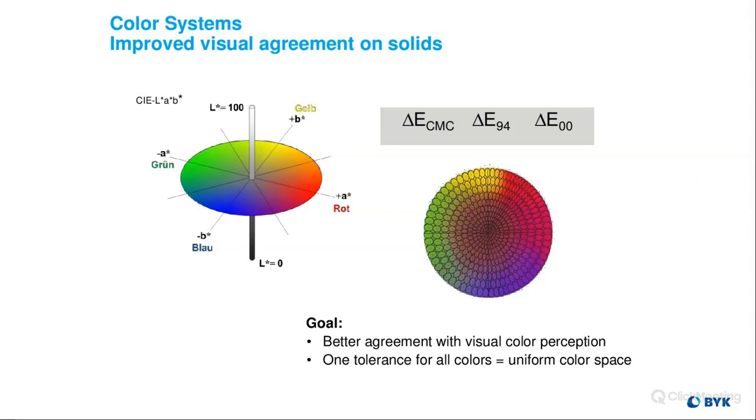Is that right? Right. In our software, I mentioned one of our instruments measures fluorescence. There's a slider and a graph, and it'll show you that right now this color has X amount of fluorescence. You can slide that slider down to zero and see what those values are going to be. Ah, cool. We'll have to do a little video clip or demonstration of you showing that software, because I think that's a cool feature that I didn't even know was in there. Not that I play with it every day, so I'll mark that down.